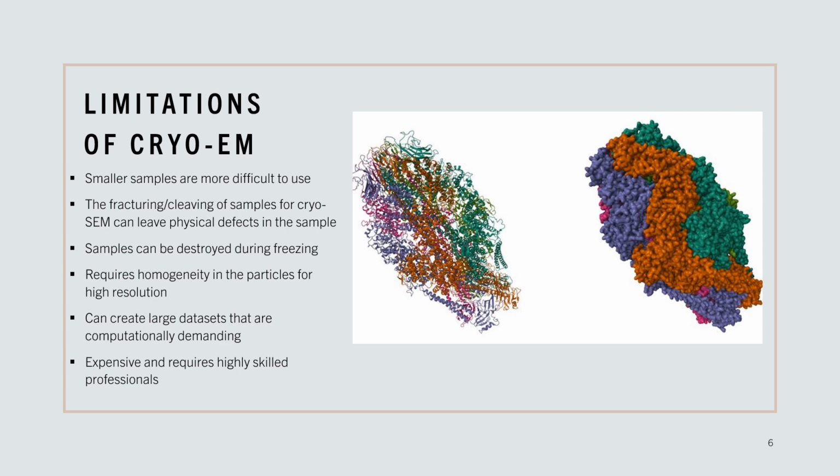The samples also require homogeneity for there to be high-resolution 3D models made. This process compiles large data sets, and these can be computationally demanding. Finally, this process is expensive and requires highly skilled personnel.